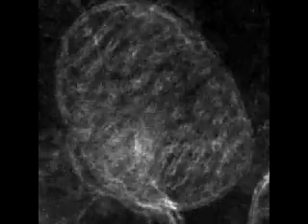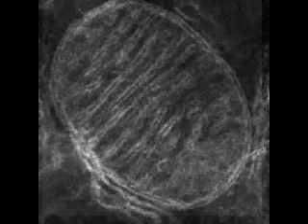Images from such a series of tilted views can be used to calculate a three-dimensional reconstruction, or tomogram, of the mitochondrion.